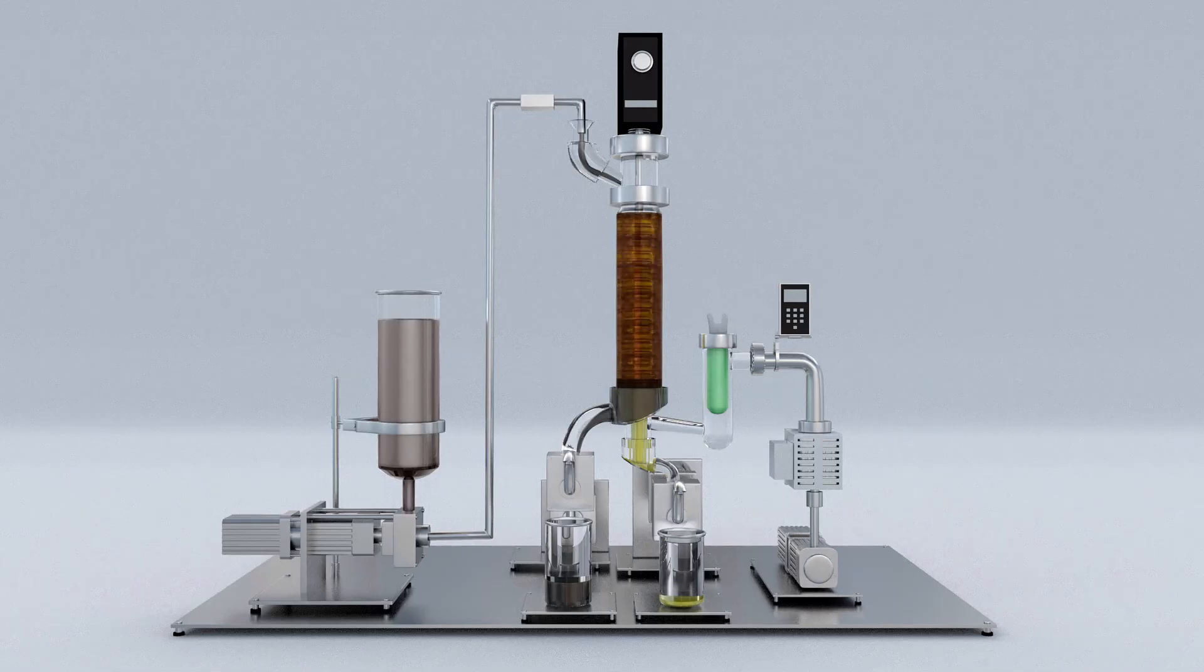The distillate fraction is often a brightly colored yellow solution that will also become solid at room temperature. Cannabis distillates are odor free, high in purity, and ideal for edibles and other medicinal products.